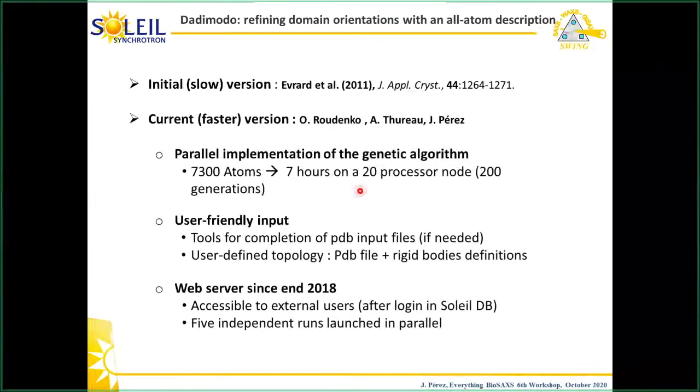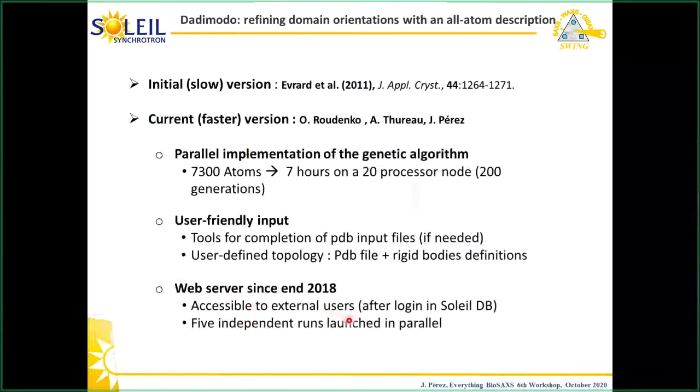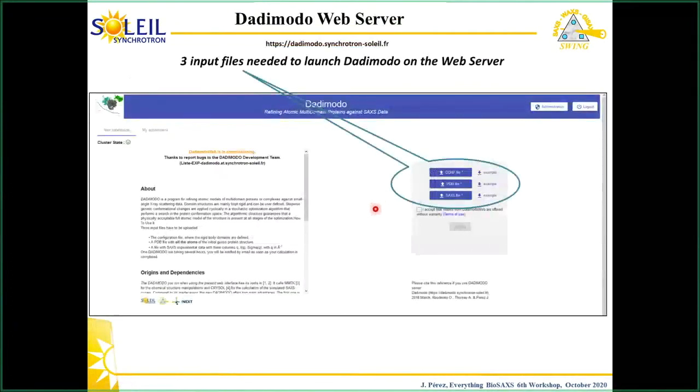And in addition to this, we recently, our colleagues from Soleil helped us to make a web server that is accessible to external users and through which you can submit your own computations, your own problems, your own subjects. So this is how the web server looks like.